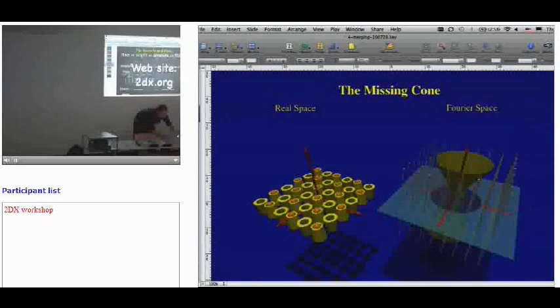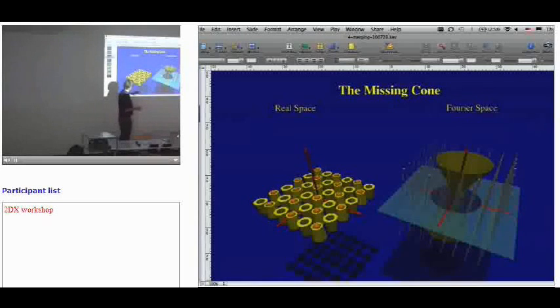If you go to Fourier space, what we have here is this case. We have non-tilted images. So in 3D Fourier space, we have now defined the variables just along this one non-tilted plane. And now we have tilted pictures in addition, and their Fourier transformations correspond to a tilted section, and we want to merge those to our two-dimensional data set, and as Anchi explained, now we have this problem that in a very thin two-dimensional data set, we can't really have enough overlap to align a tilted plane.